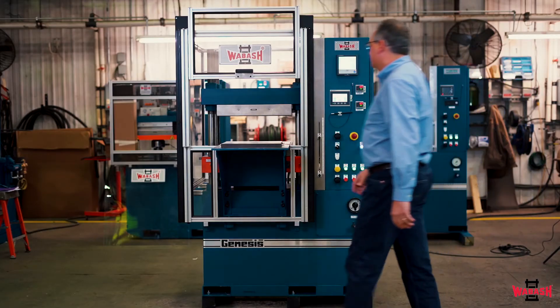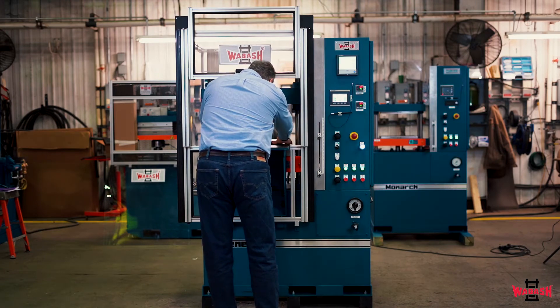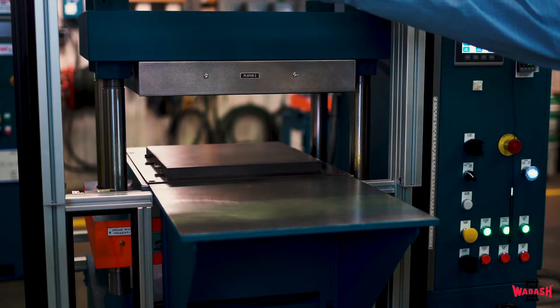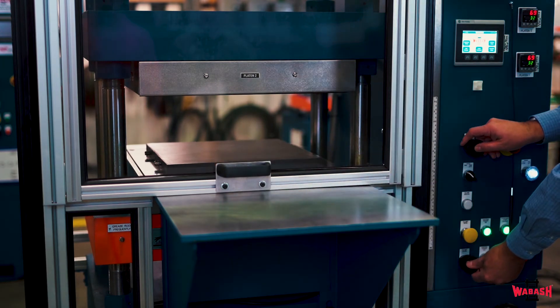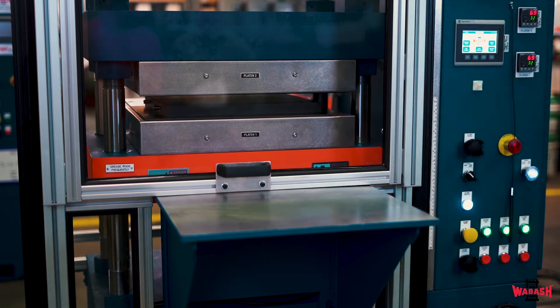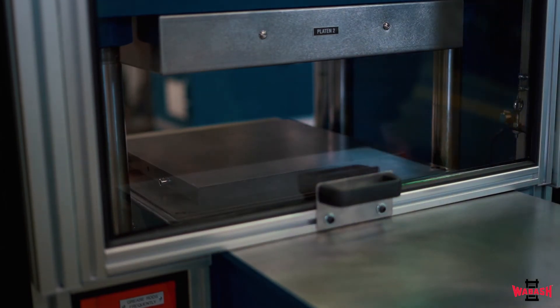Many years of research and testing from our engineering department have gone into developing these special platens. This press has all the standard safety features that you have come to depend on with a Wabash press: two-hand anti-tie-down close buttons for safety of the operator, and interlocked safety guards to keep any other personnel in the area out of the clamp area while the press is closing. This press has polycarbonate panels for more visibility of the clamp area during processing, or it's available with a light curtain in lieu of the manual front gate.